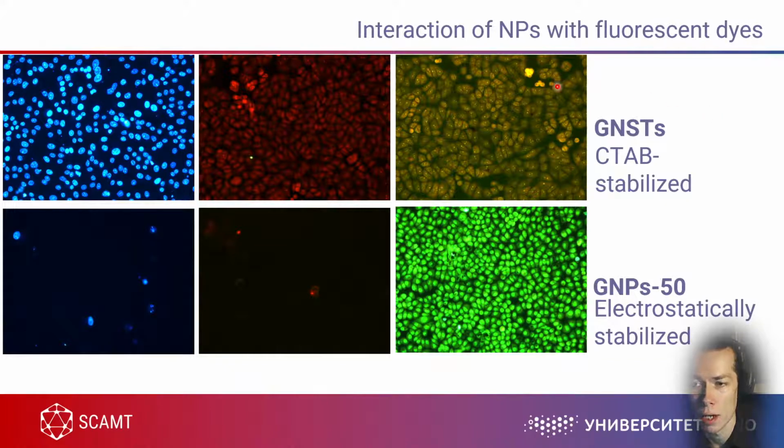But as you see here, the morphology of these cells looks quite nice. So they are probably not dead, they are all alive. And according to the MTT assay, they are even more than alive, because as I remember, viability was maybe 120% or something like this.